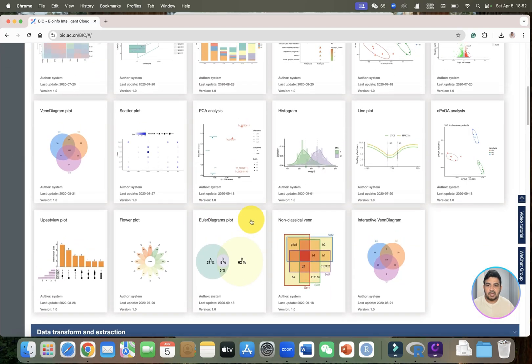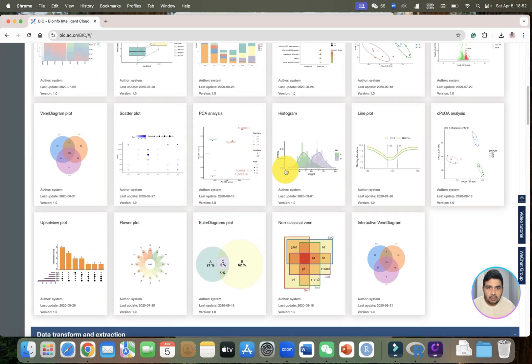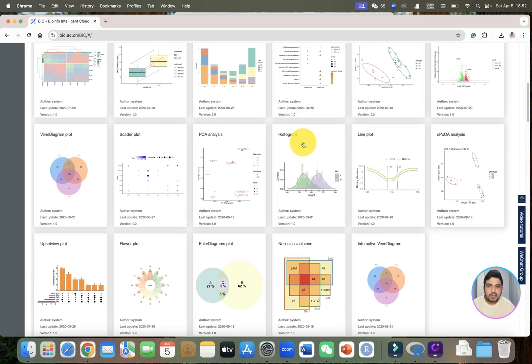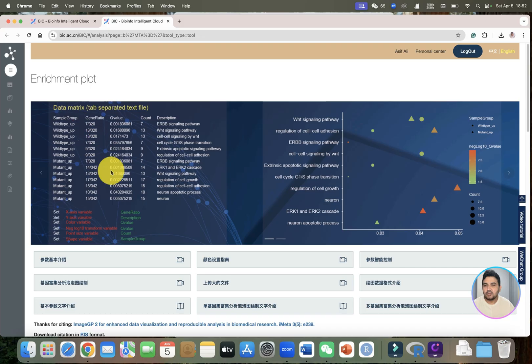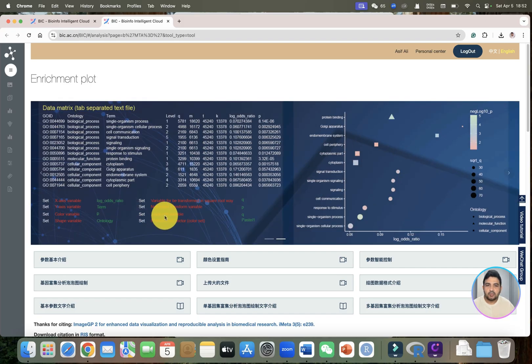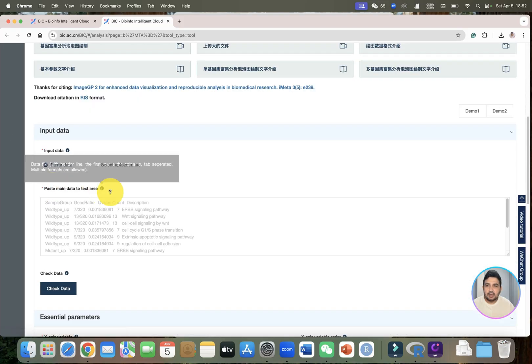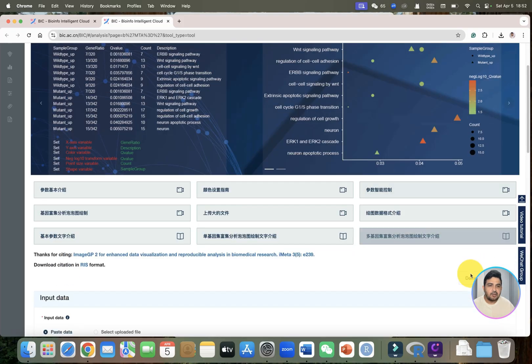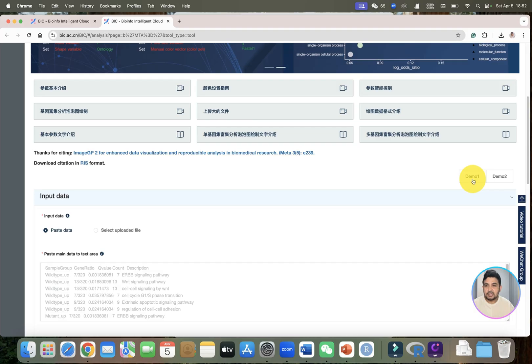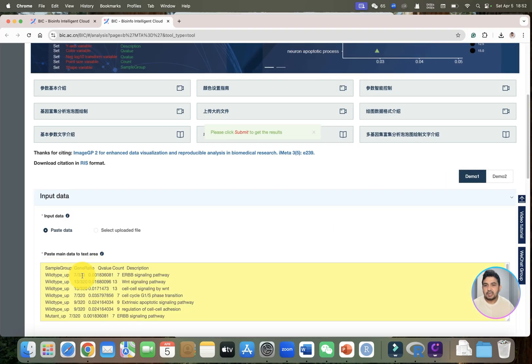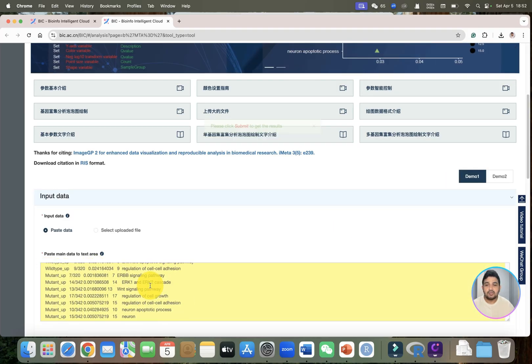Let's explore one of the enrichment plots. As you can see, they have presented the data matrix — how you need to prepare your data and what your output will look like. Once you click on Demo 1 or Demo 2, they have uploaded two examples, and the data is uploaded here ready to use.